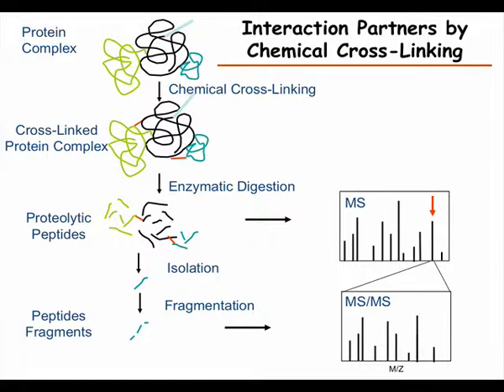But if we have cross-linked our complex, then we can wash much harsher and still keep it. If we're only interested in looking at interaction partners, we actually don't need to do much cross-linking. We can just do a few cross-links over a protein complex to stabilize it a little bit. So the idea here is that we have it cross-linked, and we can wash it much harsher.